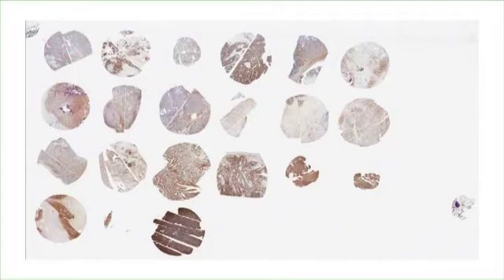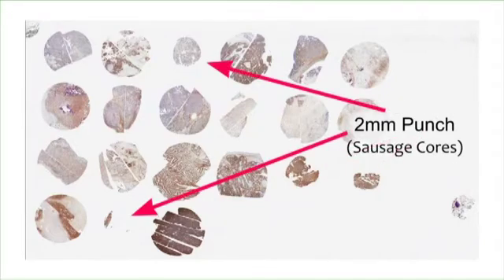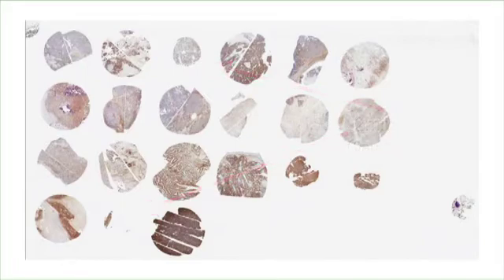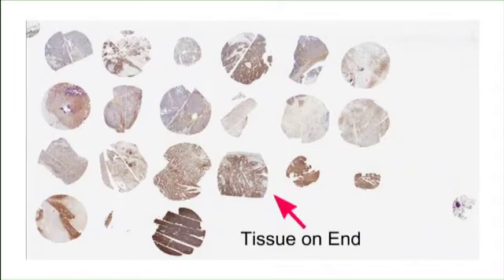There are several two millimeter sausage cores in this TMA. We were limited on the amount of tissue we could use, so we had to use a smaller core size needle to make these tissues work. This is actually a 3.5 millimeter tissue microarray. The bone marrow on the bottom right corner was added to the slide after because we didn't want to use a bone marrow in this TMA block.